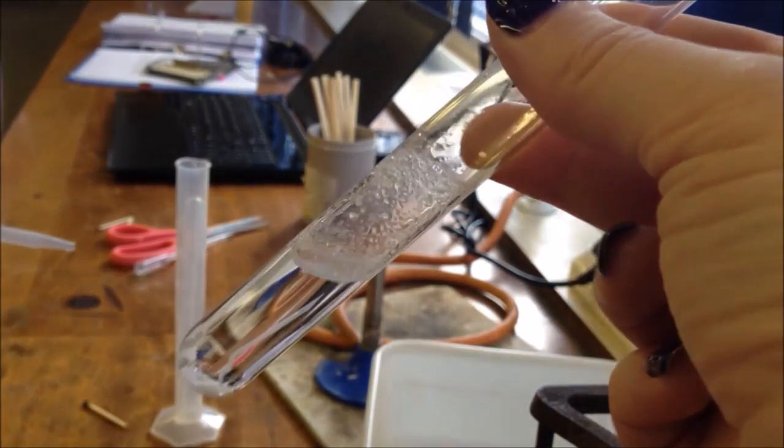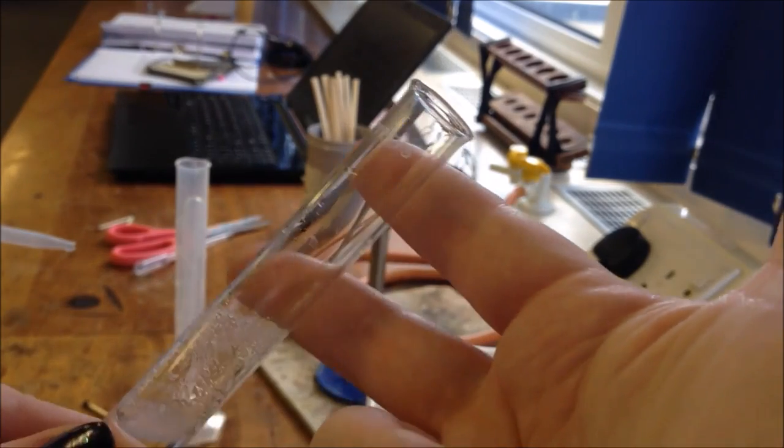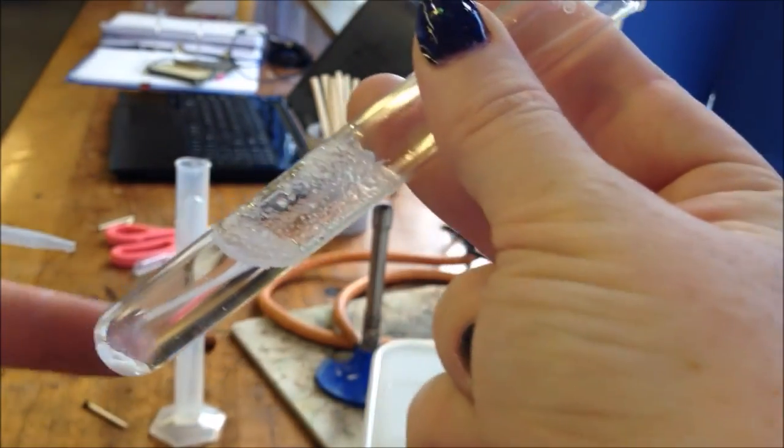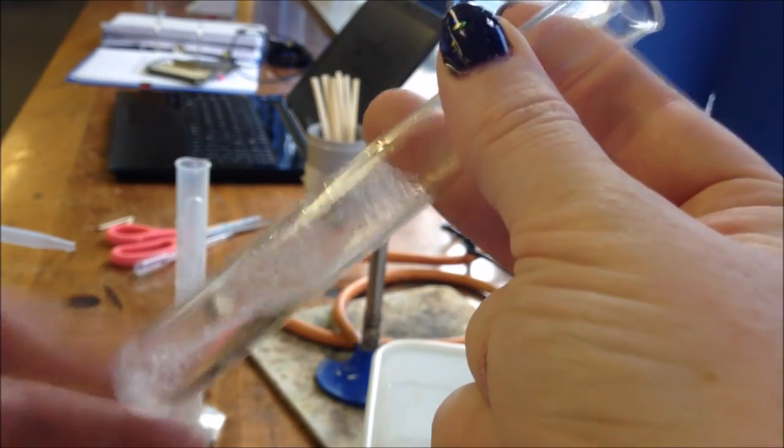Sometimes in the lab you're going to want to mix things together. The best and safest way to do this is to take two fingers and put them here and then your thumb in the middle here so you have a secure grip on the end of the test tube.